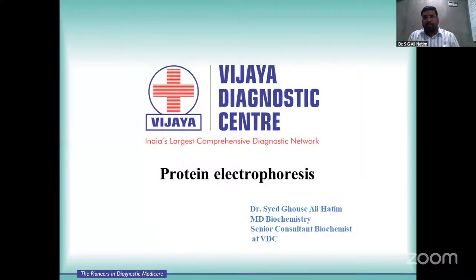So in protein electrophoresis, we'll be discussing the basic aspects of what is protein electrophoresis, how it is done, what are the different types of protein electrophoresis, what are its implications, where we use it, by which technique we are doing protein electrophoresis at Vijaya Diagnostic Center, and how we report the protein electrophoresis.